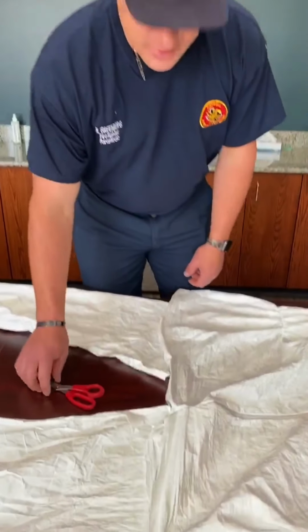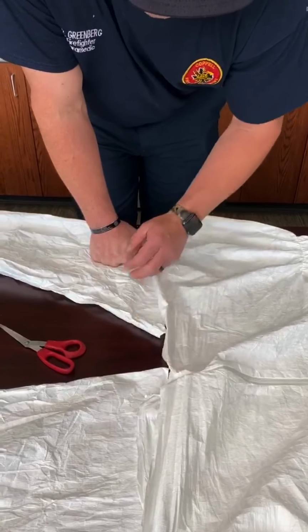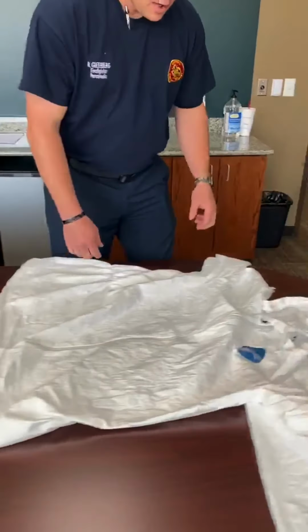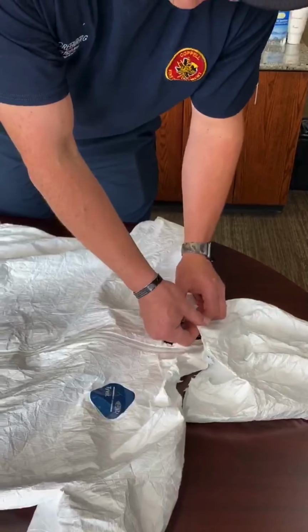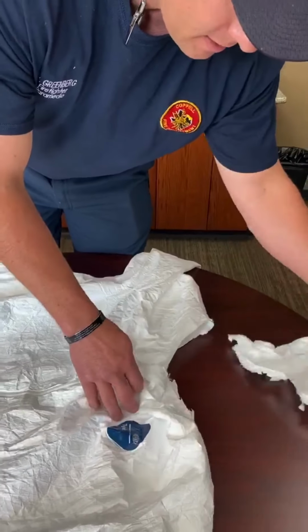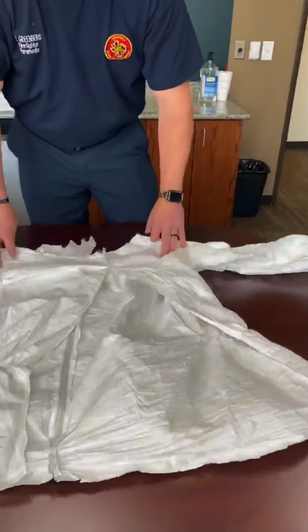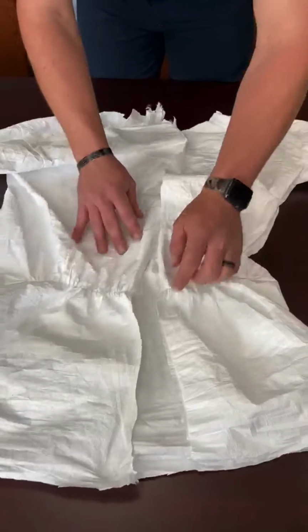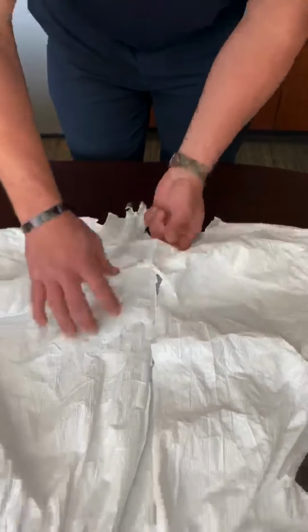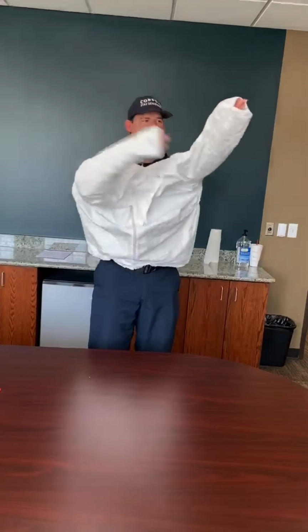So what we did first, we came across and we cut right across the top of the legs. So you should have individual leg pieces. You take those, you're done. You're going to come around here, cut around the bottom seam of the hood and then up the zipper line on the seam of the zipper, all the way around the back. Take your top piece and cut right up the middle of the top and leave about 3 to 4 inches at the top of the neckline. So when you put it on, put it on just like a gown.